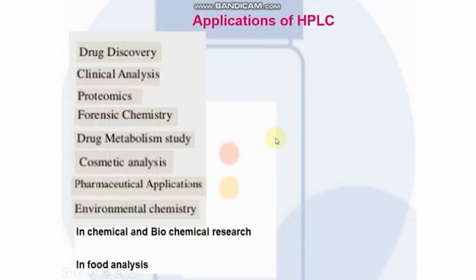Next, the applications of HPLC. HPLC is a highly sophisticated technique for the separation of components from mixtures. That's why HPLC is used in the majority of research laboratories. It may be in biochemical research, clinical research, pharmaceutical research, or chemical research.